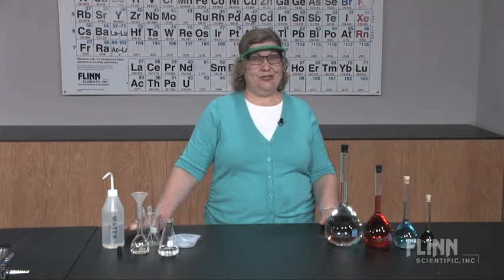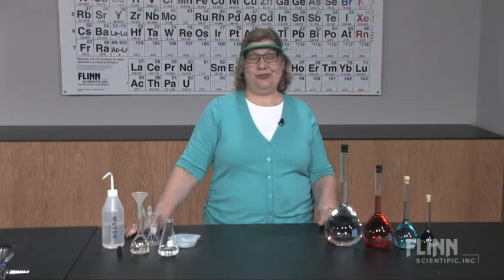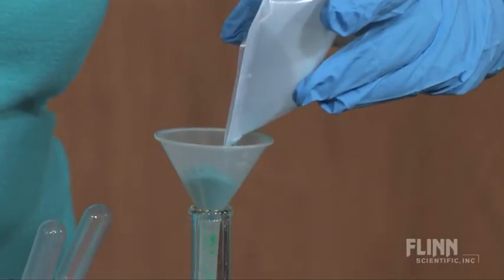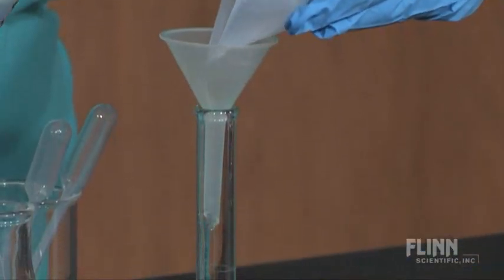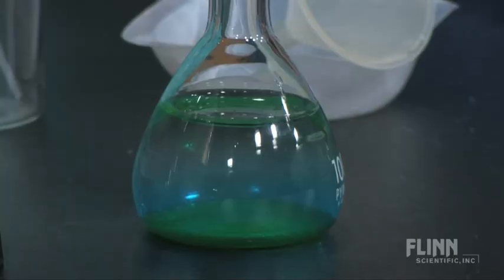Second, always use analytical transfer techniques. Transfer solids using a funnel. Rinse the weighing container, funnel, and sides of the flask with water or solvent. Dissolve or mix the solution with most, but not all, of the water.